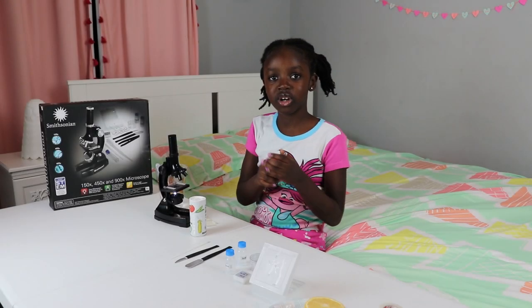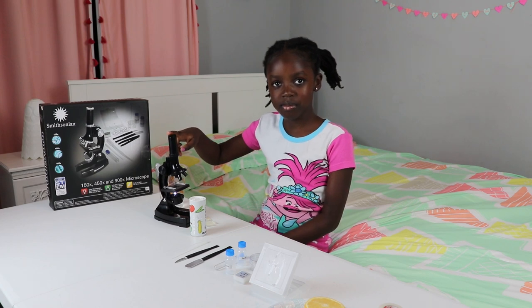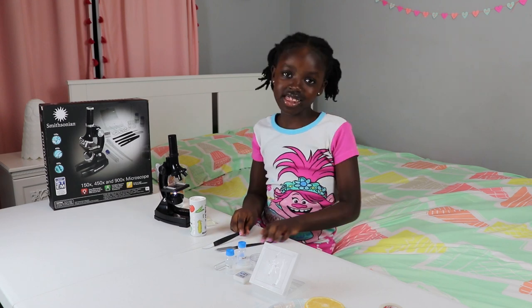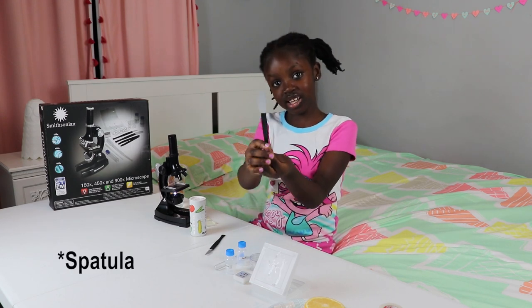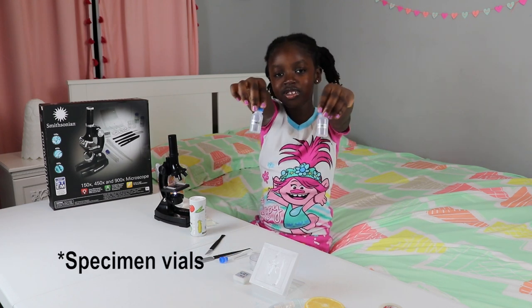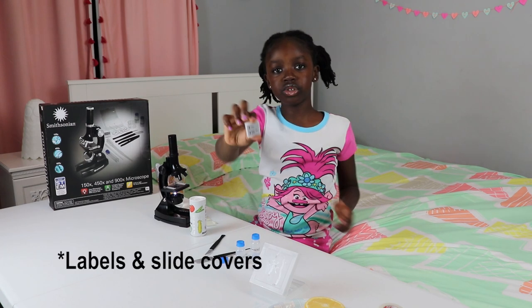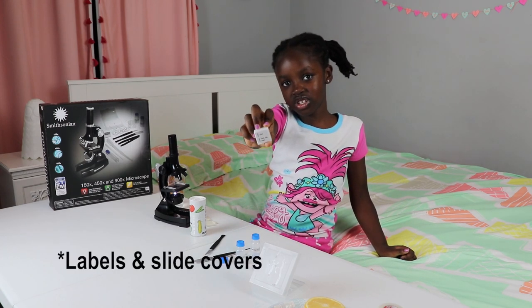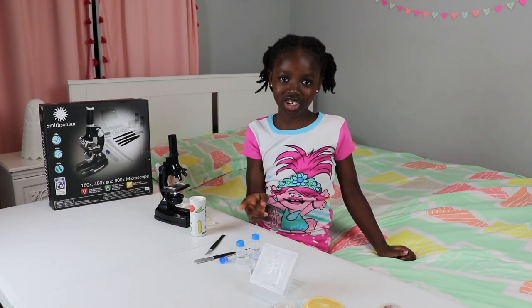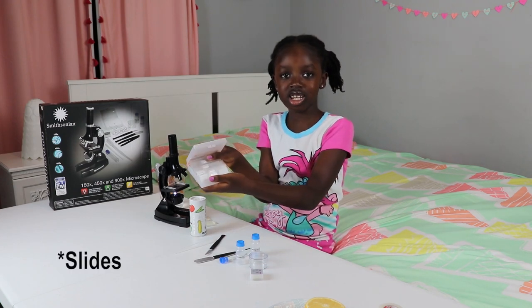These are all the parts that are included. This is the microscope, this is the stirring rod, this is the scalpel, this is the spatula, this is the test tube, these are specimen vials, this is a petri dish, and these are labels and slide covers if you want to make your own slide, which I'll tell you more about later. These are blank slides and already made slides.